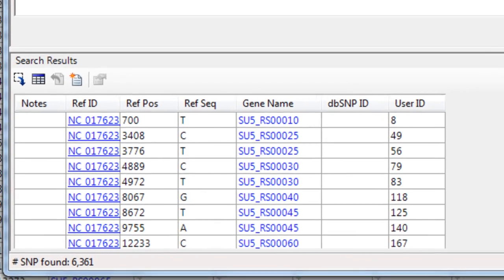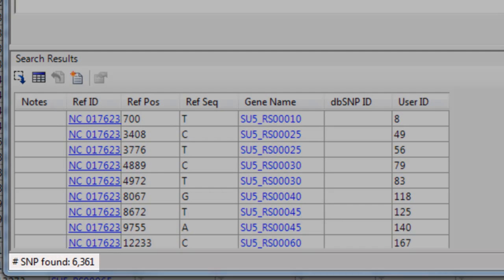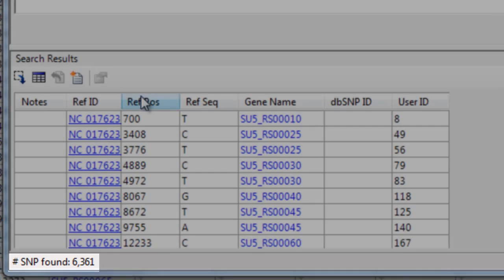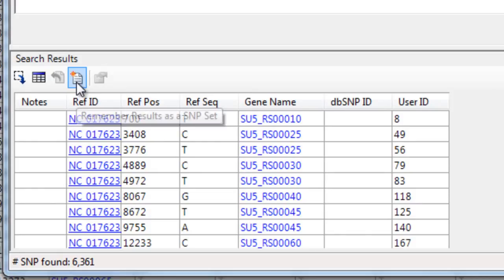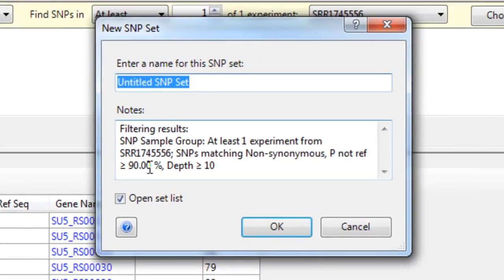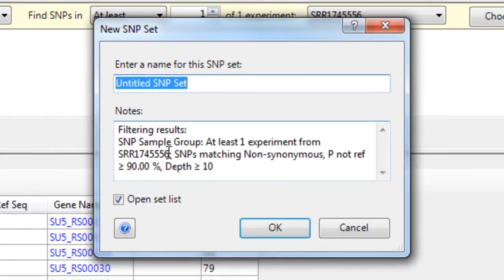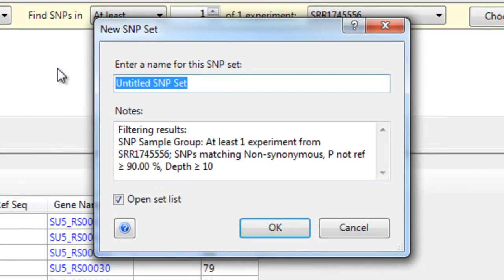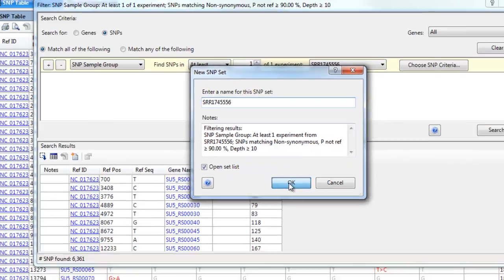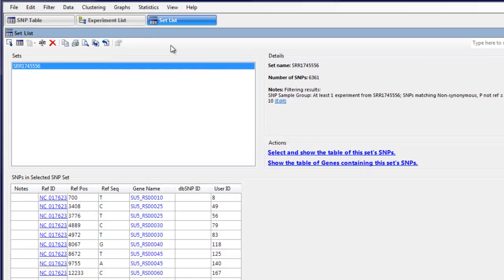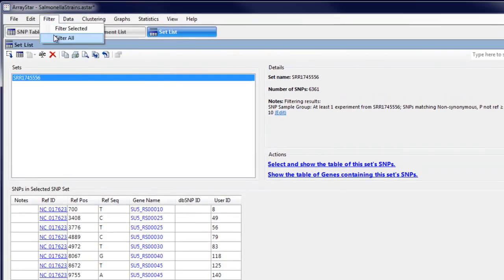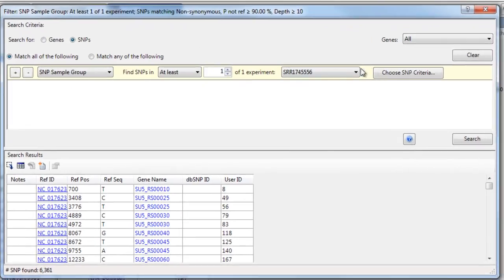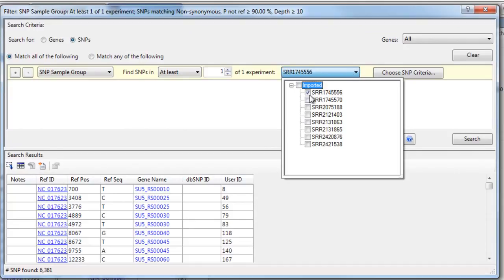You can see this locates just over 6,000 SNPs. We can save this SNP set and then repeat the search for other samples in our project.